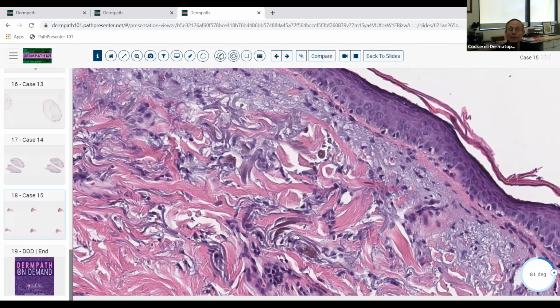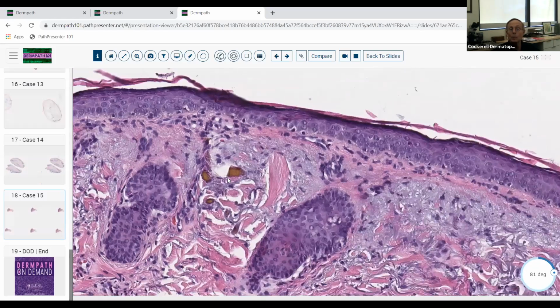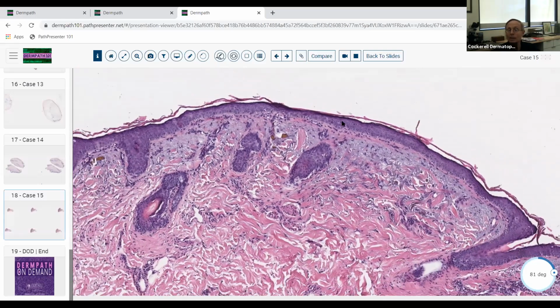So hydroquinone causes abnormality in the elastin. It undergoes this basic polymerization. It precipitates, if you will, in the skin, and then it actually gives you these little brownish papules. So the people want to make their skin light, and notice that there's no melanin up here in the epidermis, so they probably accomplished that, but they got these brown papules that develop when they got the acquired ochronosis. So that's from applying long-standing hydroquinone to the skin.